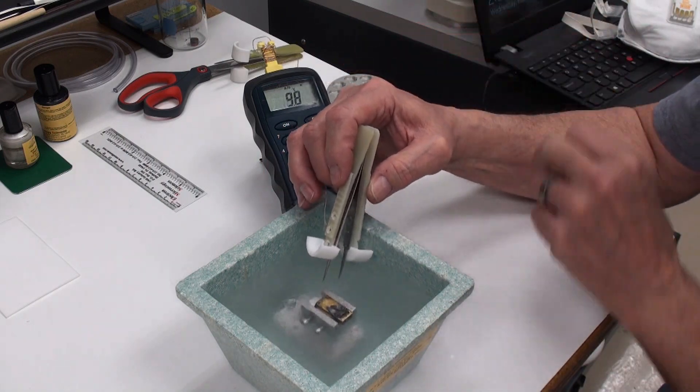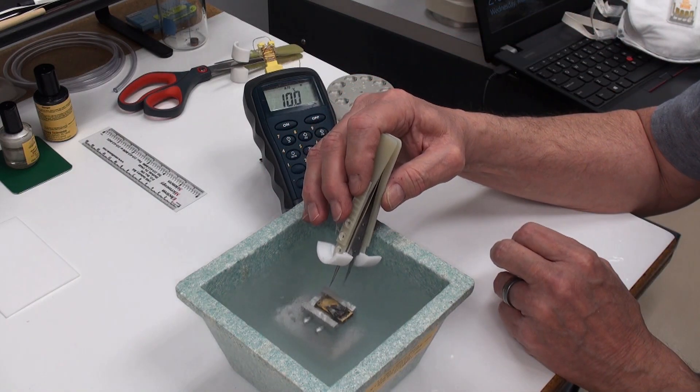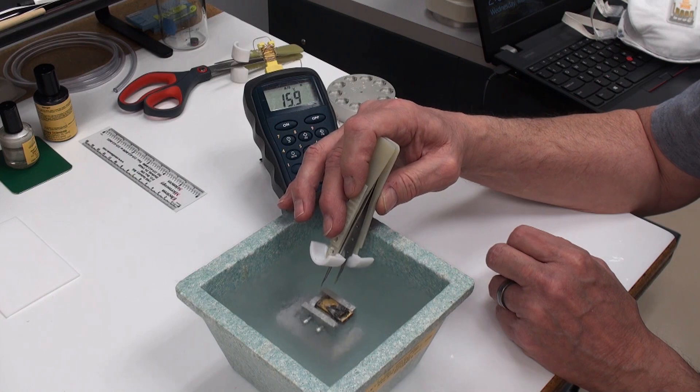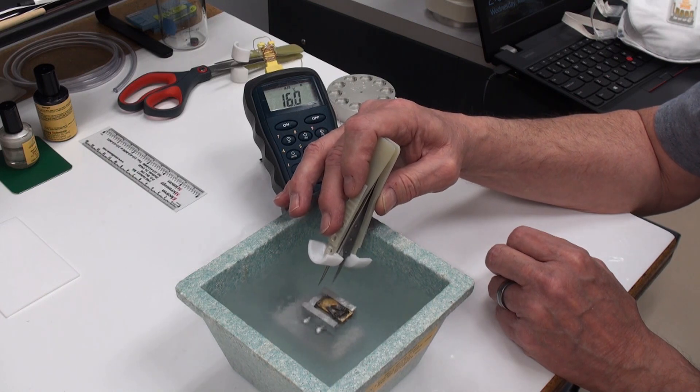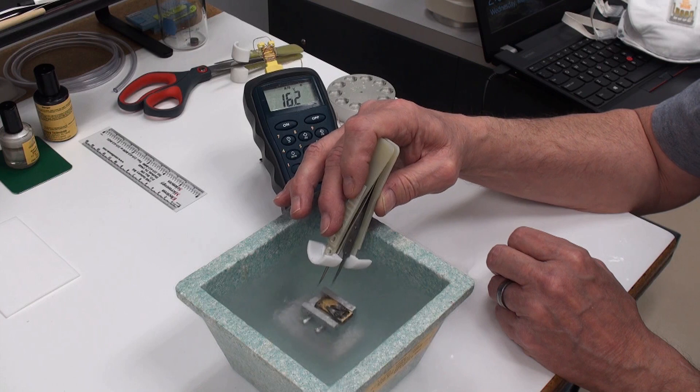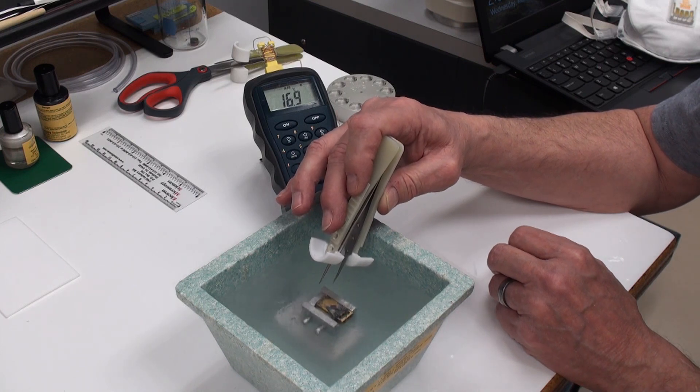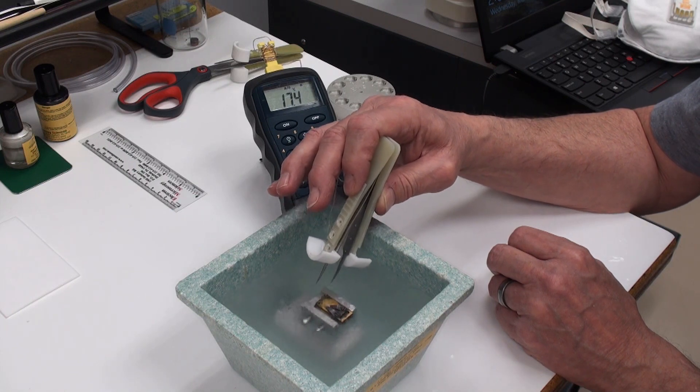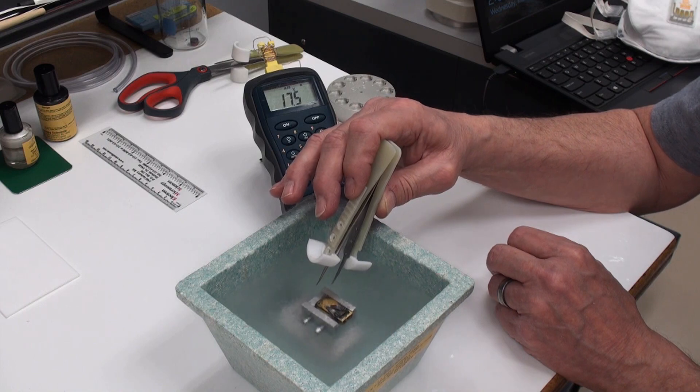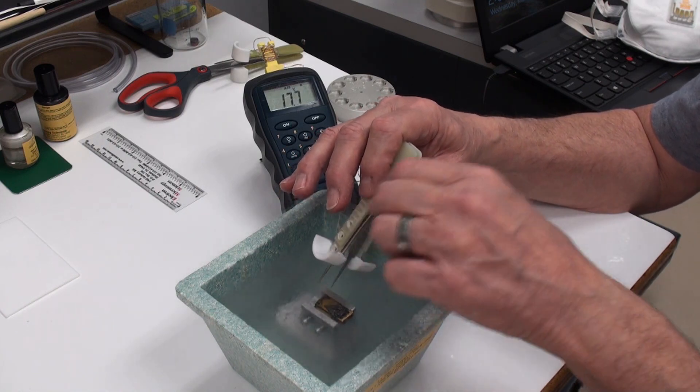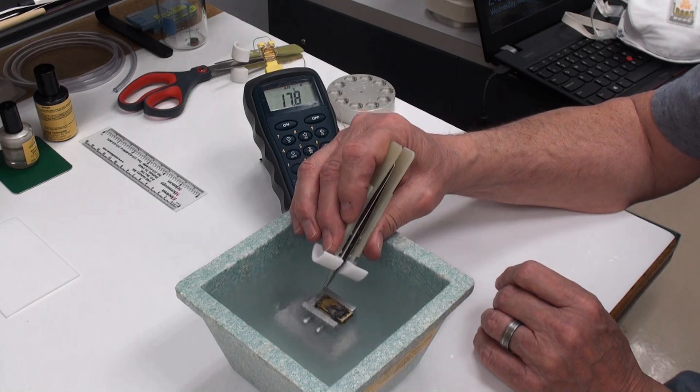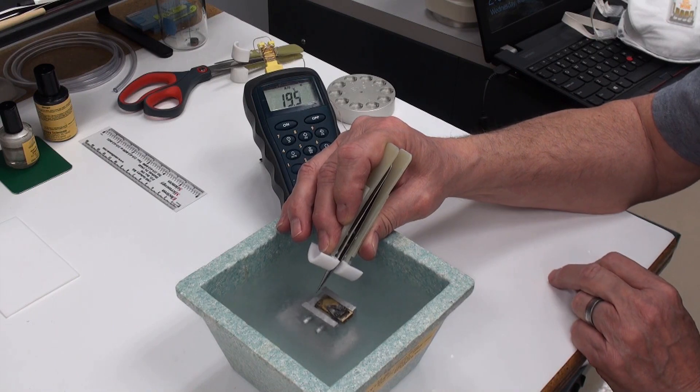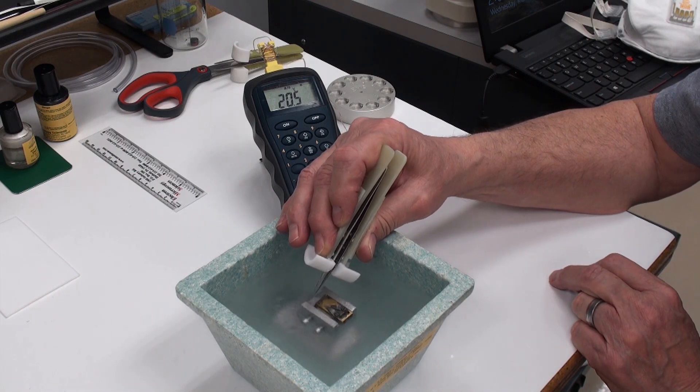I have this thermocouple underneath one of the insulation points but I've got the forceps down in the liquid nitrogen and the temperature without my fingers warming things up is at 17 Celsius. Certainly not cold enough to impede you and actually if you are manipulating things and your fingers on it, since it's insulative, it actually warms things up.